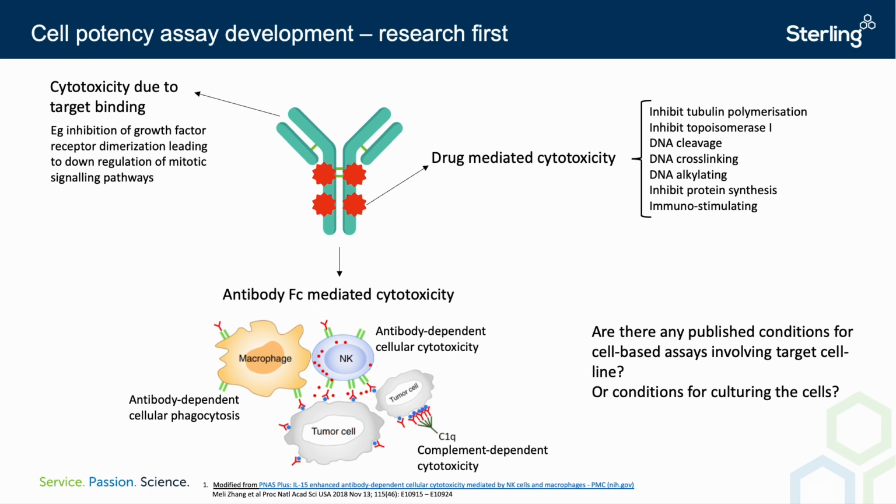It may be necessary to develop a suite of cell-based assays such as ADCC or CDC assays in order to test the various modes of action of the ADC. In particular, where a monoclonal antibody has been shown to have a therapeutic effect, it is important to establish that linking this antibody to a cytotoxin does not alter or abrogate those therapeutic modes of action. But today, we are focusing on a single potency assay assessing cell death due to intracellular MMAE activity.